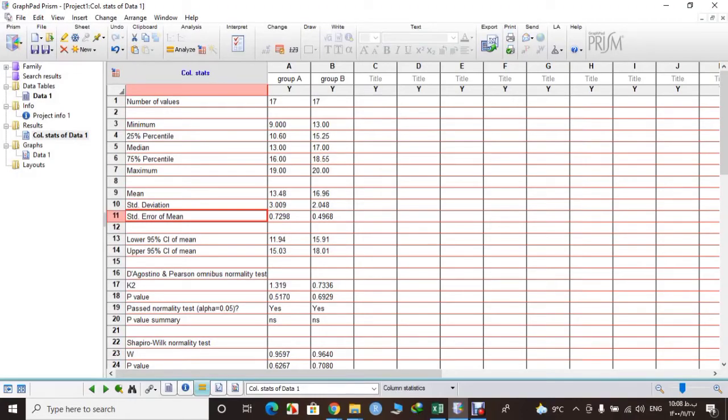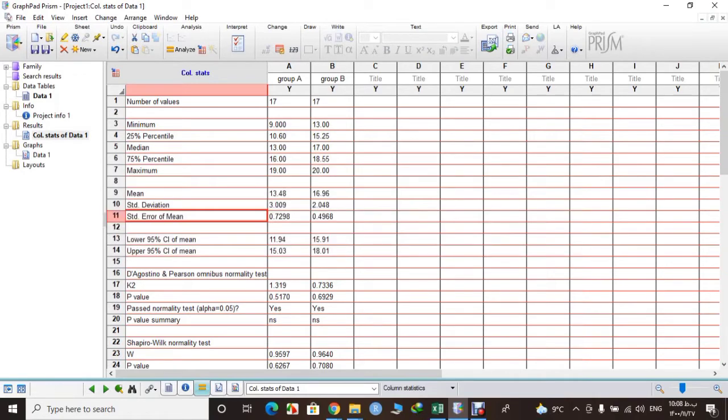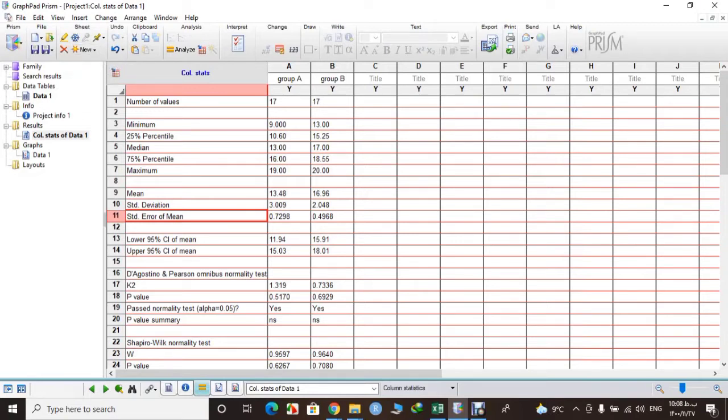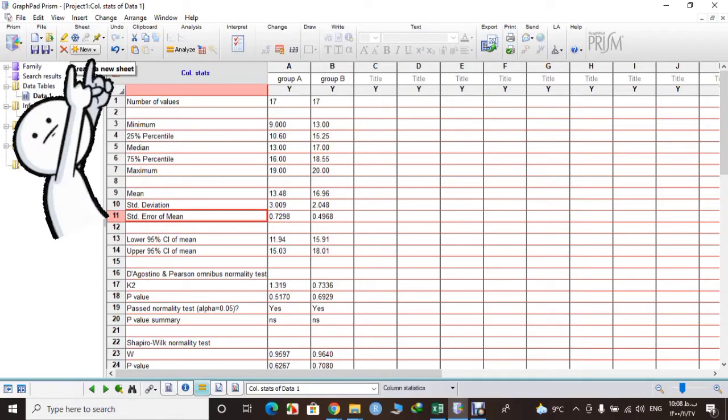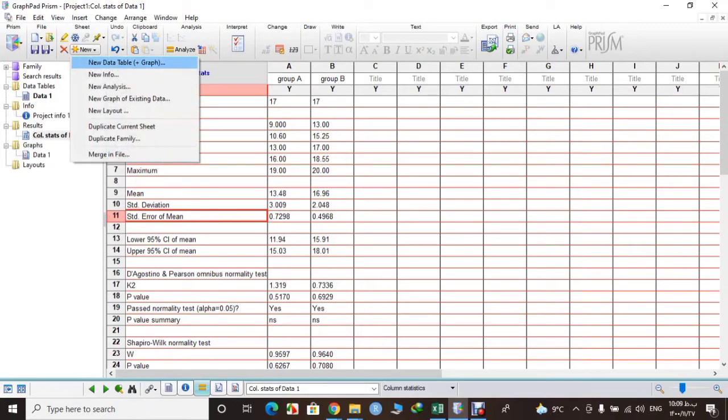Okay, here is our previous window where we checked normality. For Prism you don't need to close it and start from first. You can keep all your data at the same time and you can have several projects. Just select New and then click on New Data Table.